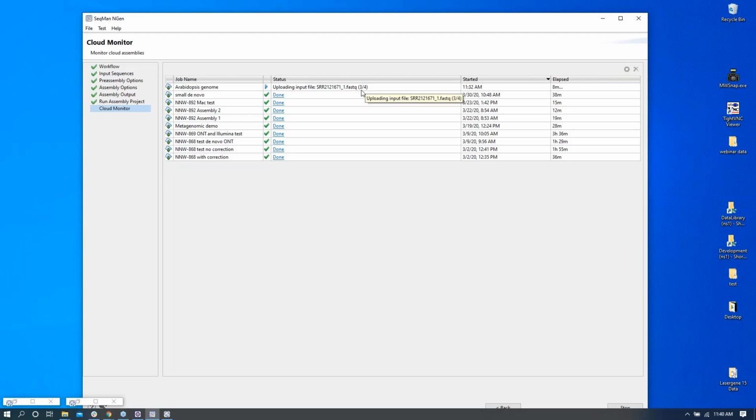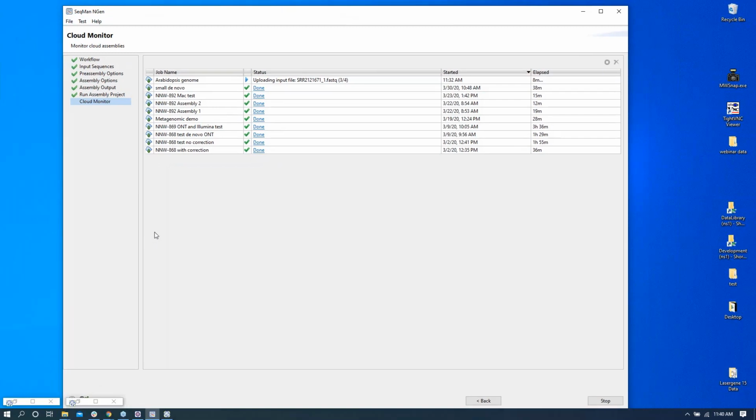Yeah, and we do have a white paper on our website. I think it's under the resources menu. You can get to the white papers, and it explains how the cloud operates and how the data security works with that Amazon cloud.